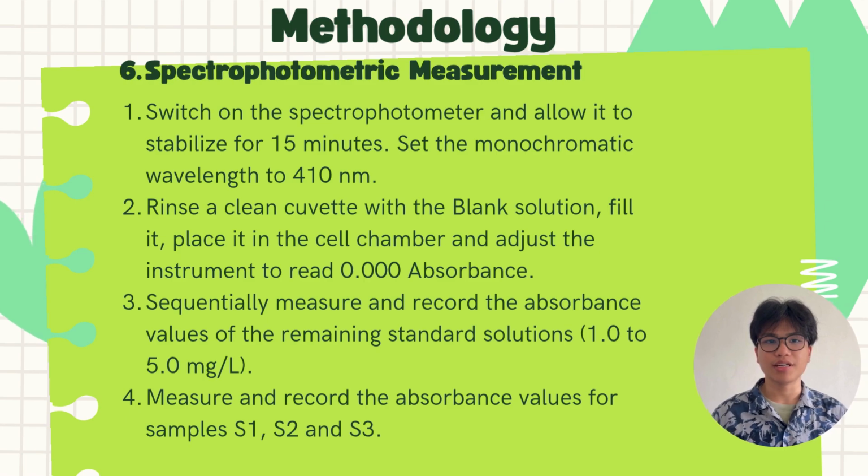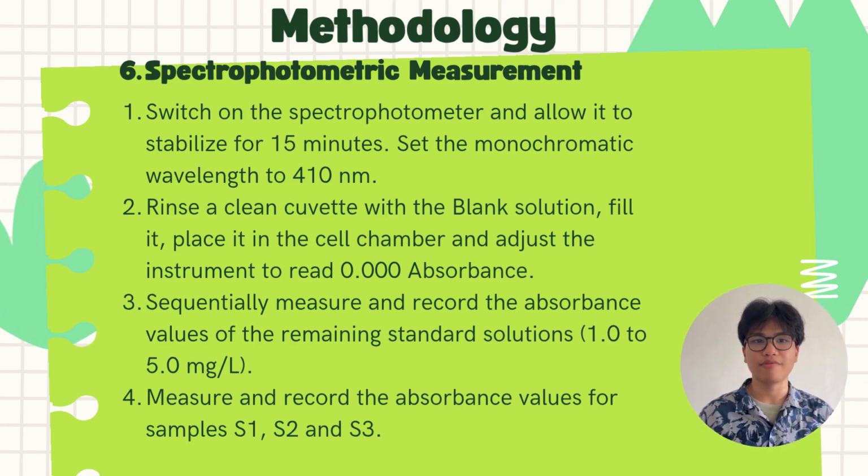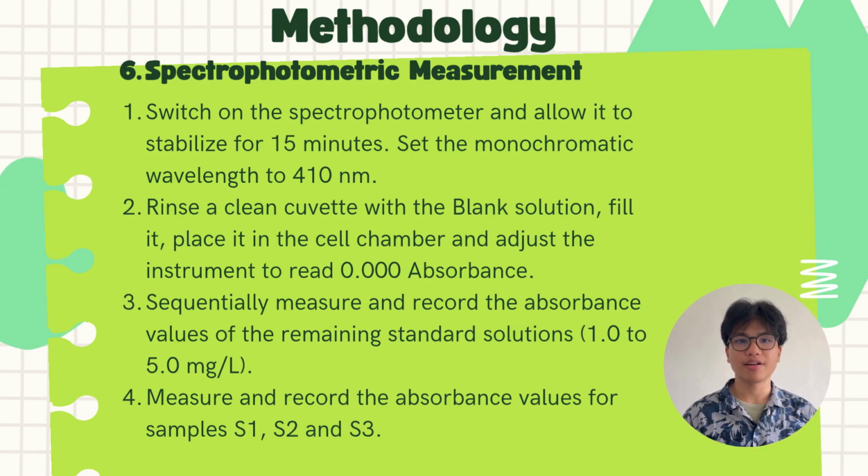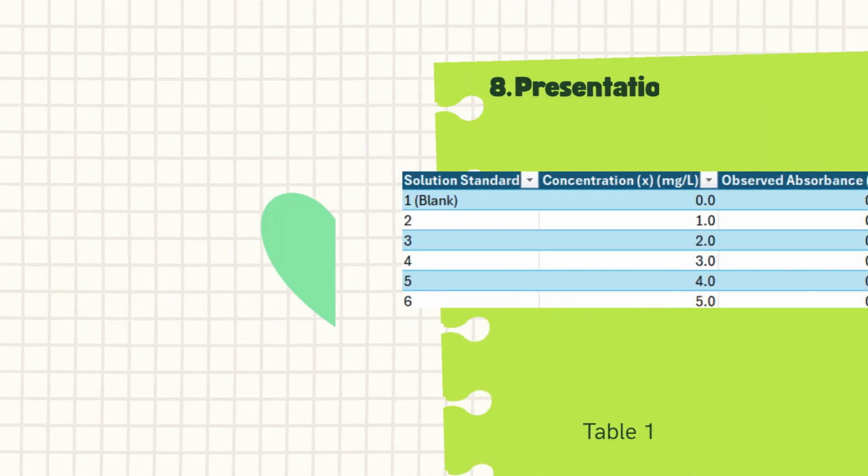Next, sequentially measure and record the absorbance value of the remaining standard solutions. Lastly, measure and record the absorbance value for samples S1, S2 and S3.